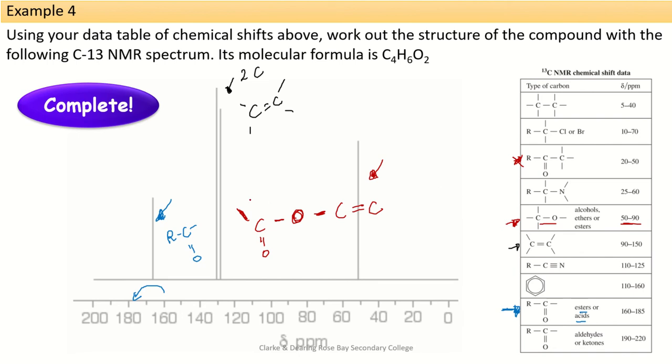So we have that. Now, obviously, we are missing a carbon, so logistically speaking, we would expect that our last carbon would be carbon here. As you can see, it's not possible for the carbon to be on this side, or neither the double bond to be on this side of the carbon.